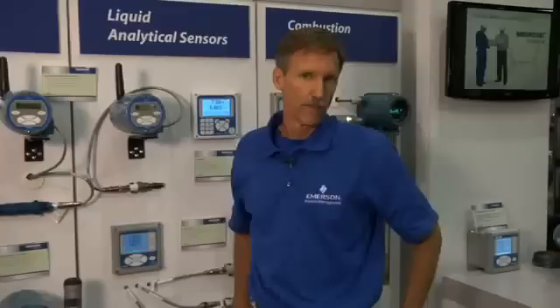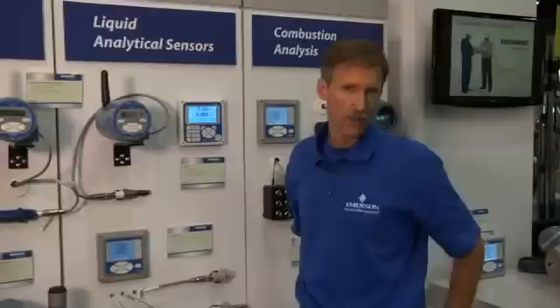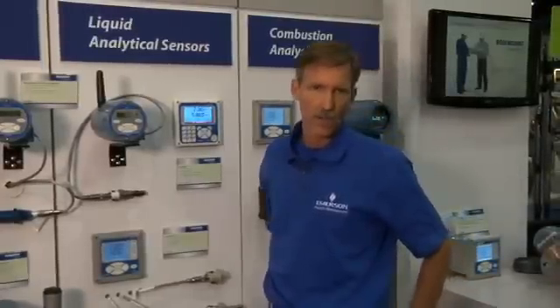That should give you an understanding of some of the key features of the Model 1057 analyzer — how it allows three inputs of measurement and solves problems for customers like OEMs and pharmaceutical companies that require redundant measurement. If you want more information about the Model 1057, you can refer to our website at railiquid.com.